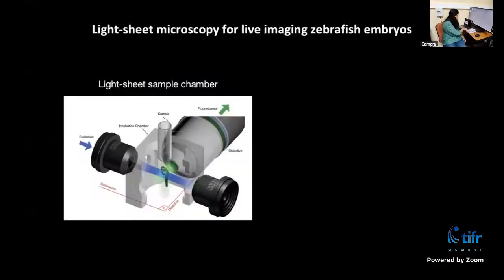As Shubhanjan said, the principle of fluorescence involves excitation of a fluorophore, a molecule that can fluoresce, by a wavelength of light. Upon excitation by this light, the fluorophore emits light with a different, higher wavelength. To illuminate molecules with very particular wavelengths of light, we use lasers.